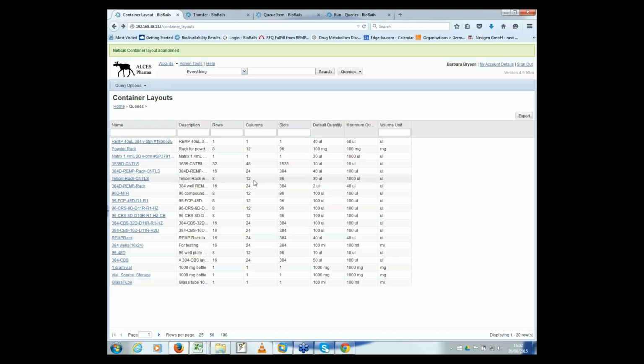Okay. Next question, can I define the size of the plate I want to create? I think this goes to custom plate layout. Yes, I think I just showed you that. So you saw the dimensions where I customized the dimensions.